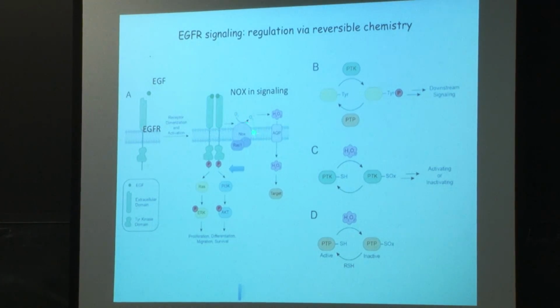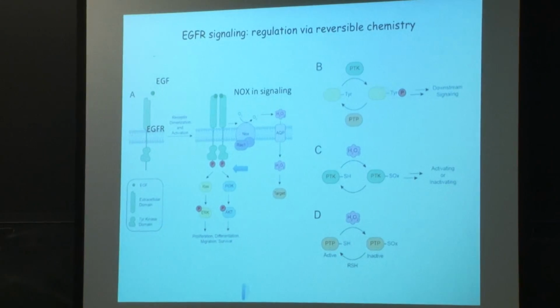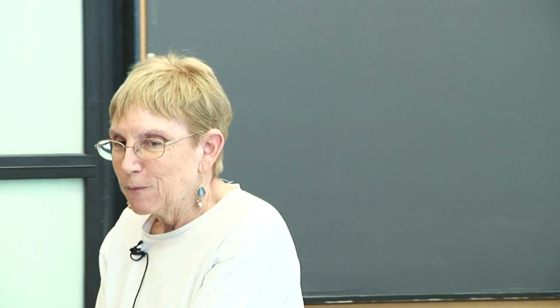So we're going to generate superoxide, and it's on the outside of the cell. This is a transmembrane system. If you read this paper carefully, and we'll look at data, is there anything that links these two proteins in this paper that you were supposed to read? Even if you read it, there's not that much data.